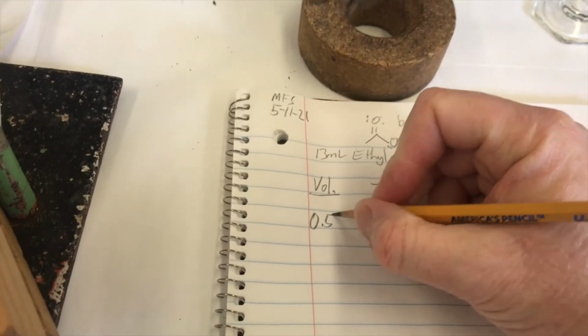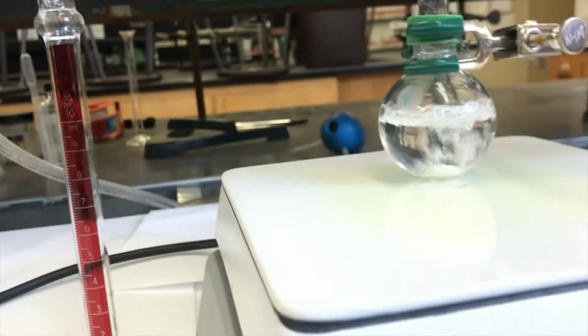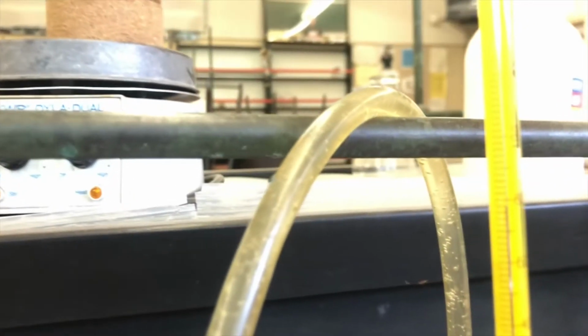This data is not going to be that great, but it's going to be something to collect though. Okay, this is good. I don't need to wrap it. It's a warm day in lab. I think I'm at a milliliter now again. Yep, I'm at a milliliter, and the temperature is about 78.